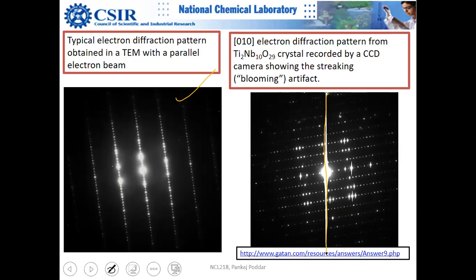Answer is written here. Because you are basically saturating the charge coupled device, CCD, those sensors, with a lot of light. So that's why there is a blooming artifact. This is the same thing actually, because the sensor is based on the same science. Okay, so one should reduce the intensity. I included this to show the artifacts. And nowadays there are better detectors. You can see that.